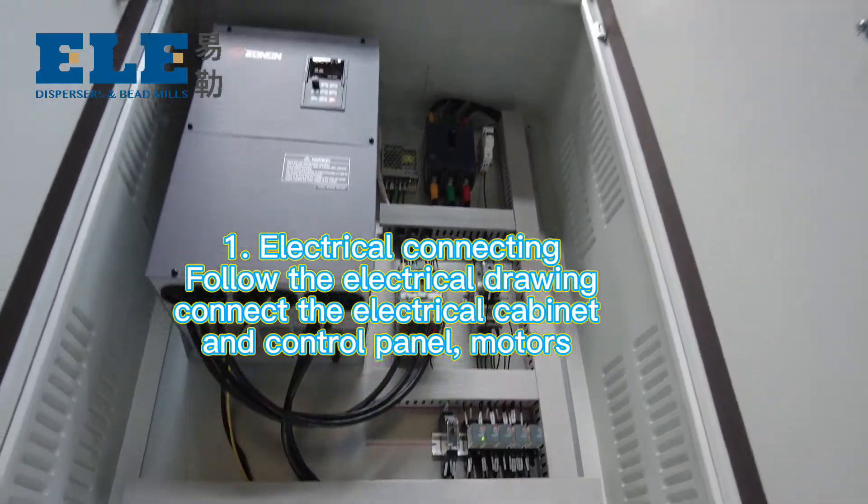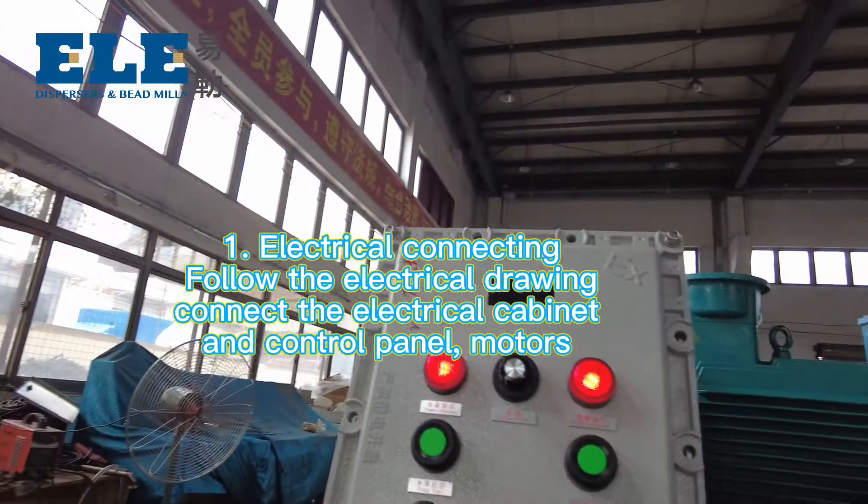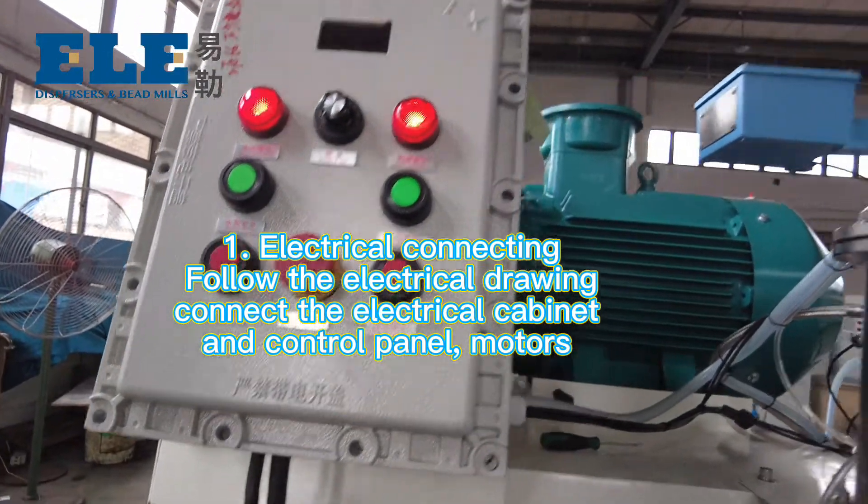First, electric connecting. Follow the electric joint — connect the electric cabinet to the control panel, motor and pump.